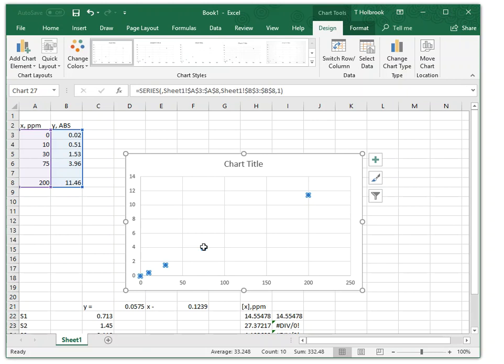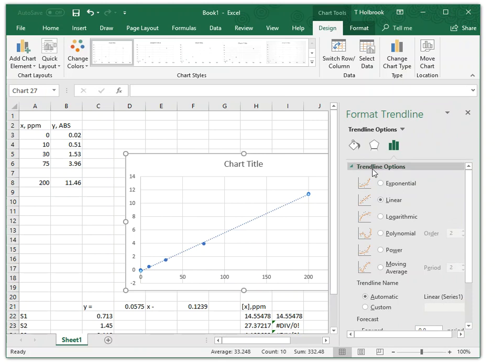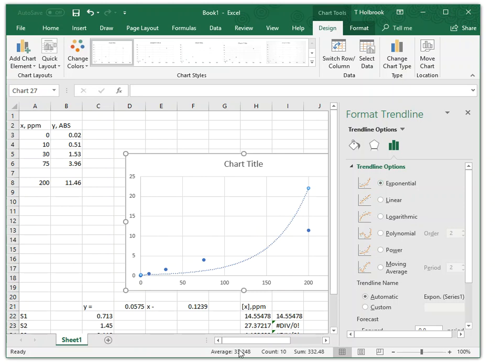However, if you click on the point and add the trend line, like we've done in all of these other examples, you're going to see trend line options right up here. Almost every single time, we're probably going to choose linear based on what kind of data we have. However, if I choose exponential, look at the graph and see how it automatically changed. If this data fit an exponential line, it would go through the majority of the points, and it does not.